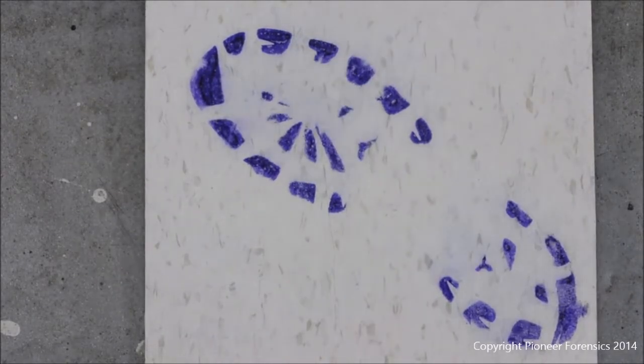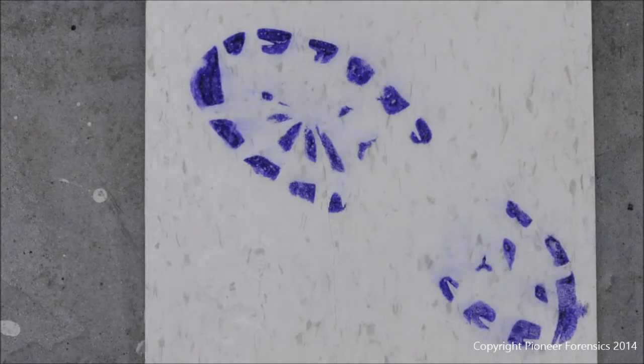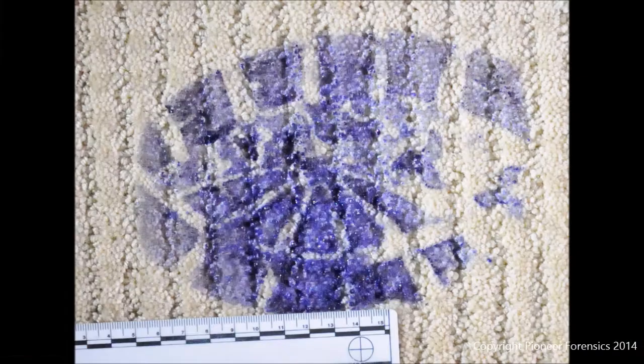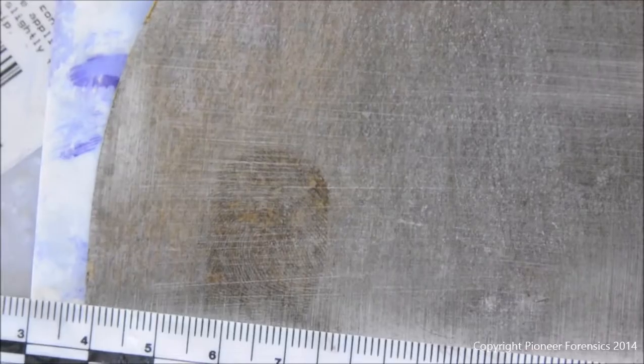LCV also has a fixing agent mixed into the solution, so when you apply LCV to the surface it maintains the integrity of the impression on that surface. Once it is stained, it is somewhat permanent, meaning that even rinsing this with water, as you saw in the footwear impression, does not ruin your impression.